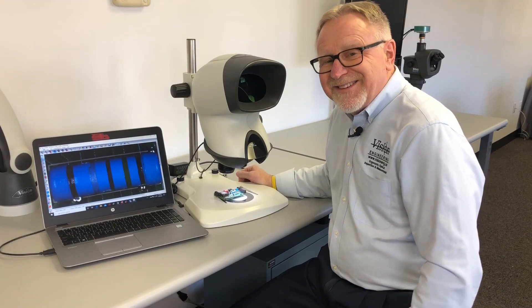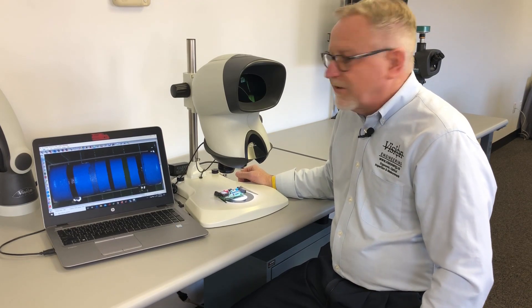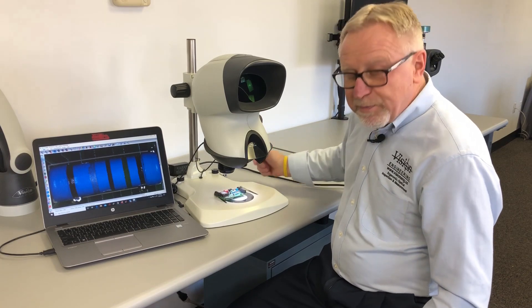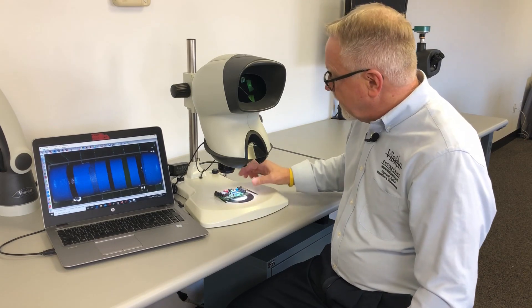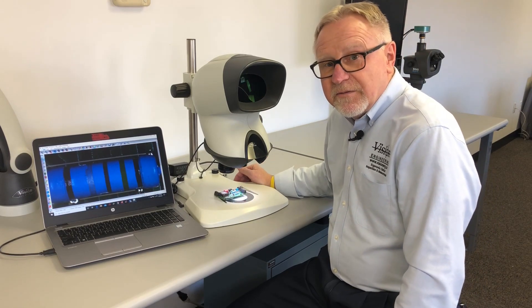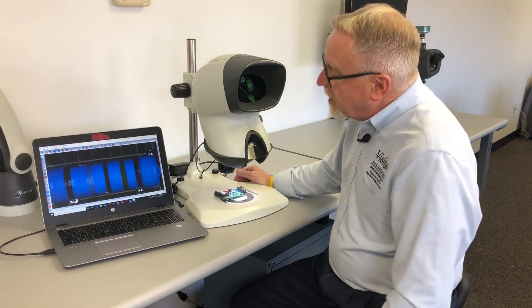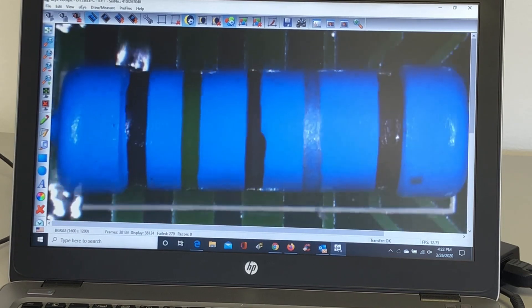This variant of our Mantis Elite is the Mantis Elite Cam HD. It incorporates a full HD camera into the Mantis. You can't tell that the camera is in there other than the fact that it has a USB connection on the back. USB runs to your PC — boot up the software and you now see what the operator sees in the scope on your computer screen. The image is live to the computer and the operator can't tell it's even there. There's no beam splitter or levers to throw; it does not capture an optical path, it shares it. The camera lets you capture still images and moving images in an MPEG format.